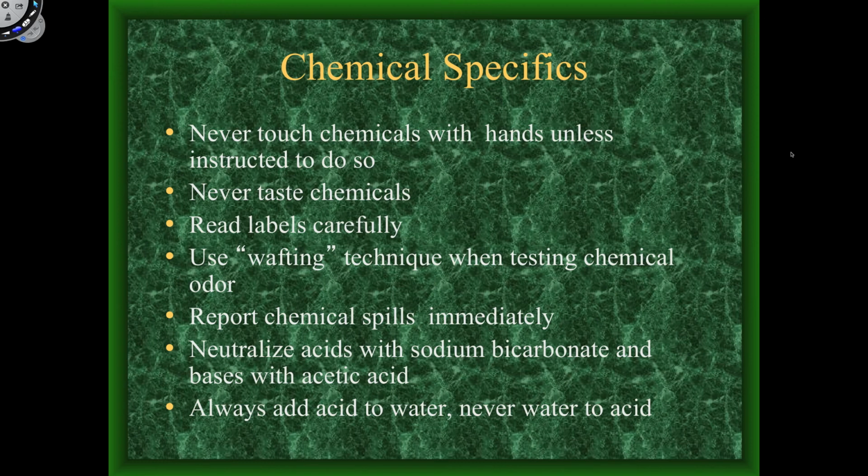Whereas if you are adding the acid to the water, the reaction is not quite as vigorous. You're less likely to get spattering. And if you do get spattering, it's typically going to be a diluted acid, as opposed to the acid that's very strong being spattered up. So always add acid to water, never water to acid.